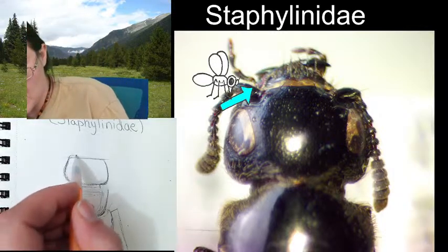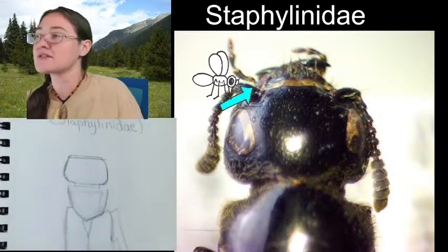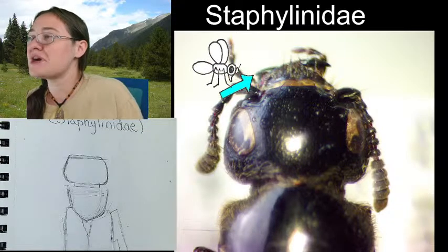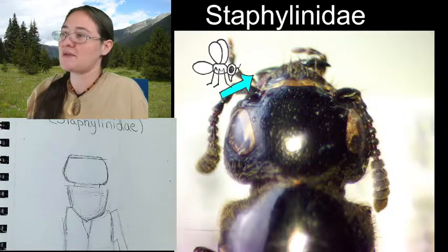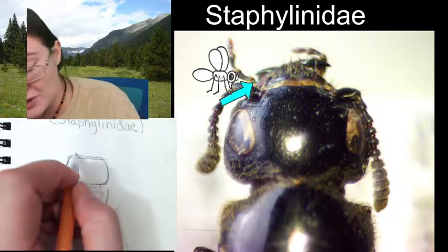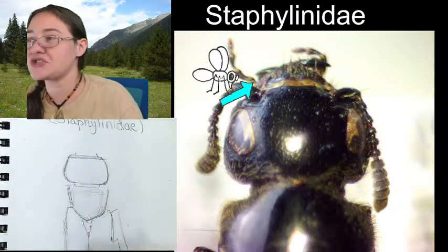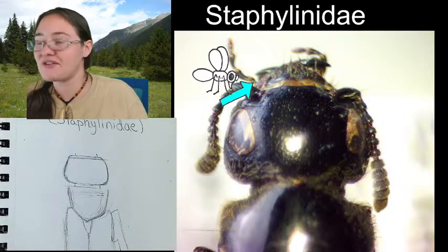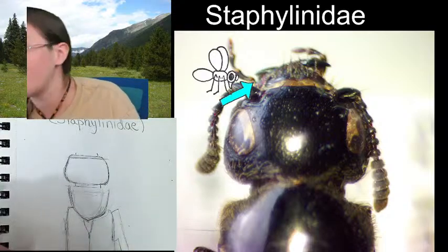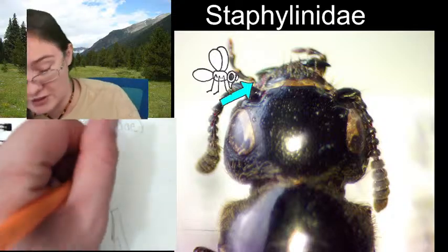And then I'm going to go up one segment and make that just a little thinner than the next. And so that's that little gold line. And then we have a bunch of mouth parts here. We've got a bunch of different things happening. We're going to need to zoom in on the mouth parts, I think, to finish that up. So I'm going to put my eyes on our head here, and then put the antennal sockets, and then we'll zoom in on those mouth parts.